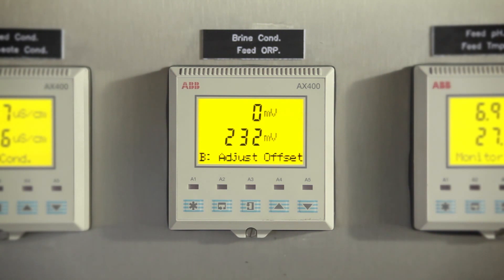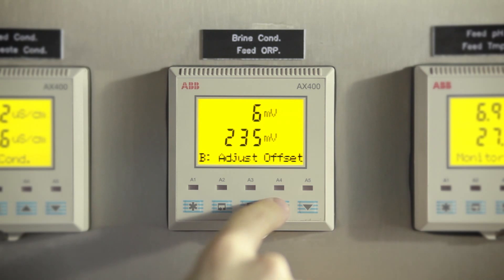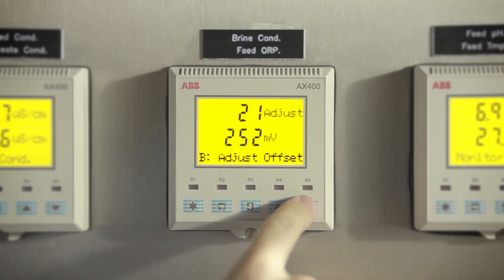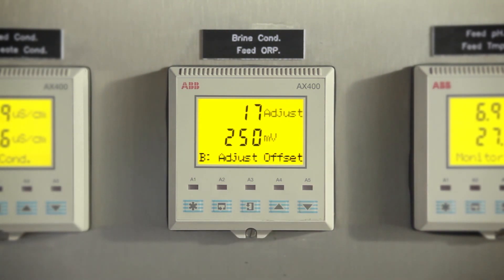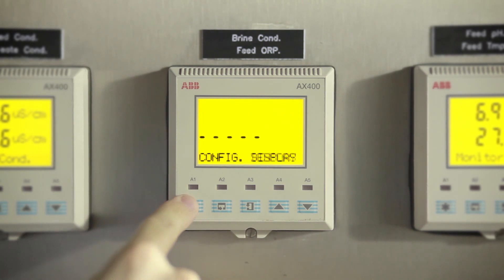Proceed to the next frame and adjust the offset. Millivolts and adjust are shown alternately on the upper display line. Use the up and down arrow keys to adjust the upper display line to the required offset value for the process. To enter these settings, press the scroll down key, then press star to return to the main menu.